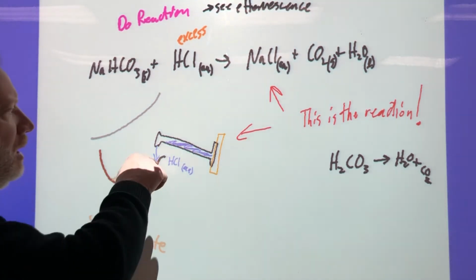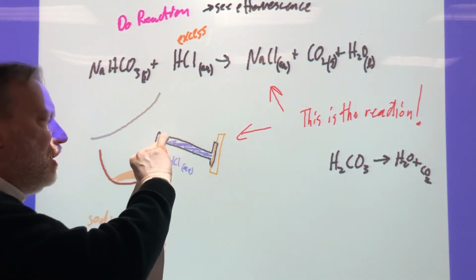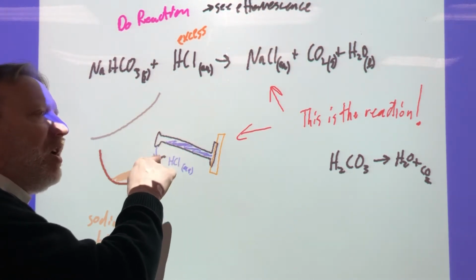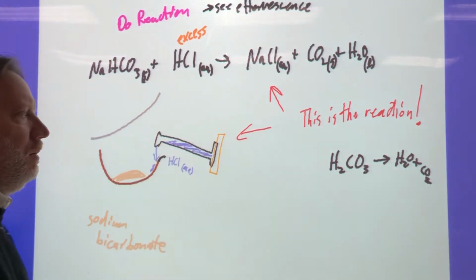And I'll have you do that slowly. Basically, there's a little lip in this with the lid on. You want to pour in a few drops at a time. Let it fizz, let it fizz. After it's done that for a while, and you've got some liquid volume in there that's watered down, you can start adding it a little quicker.